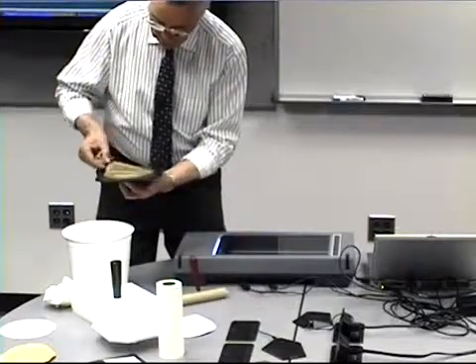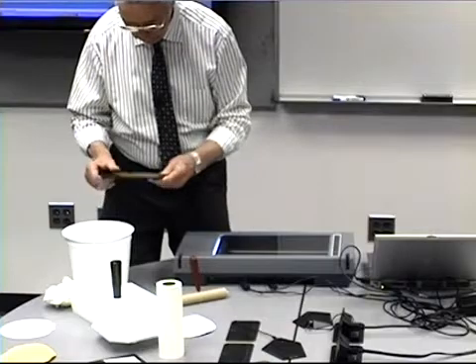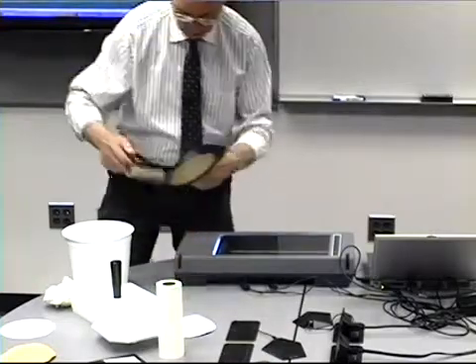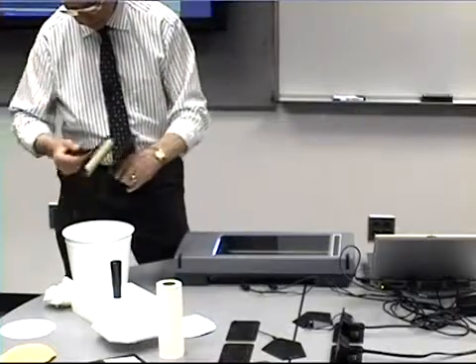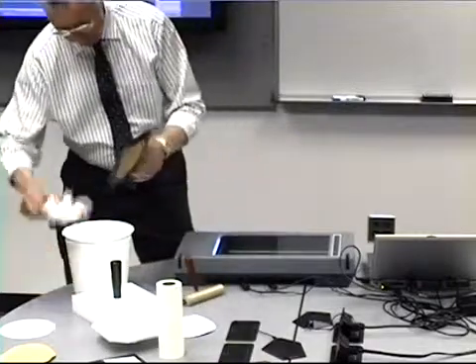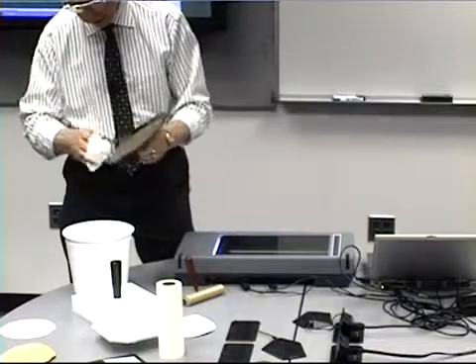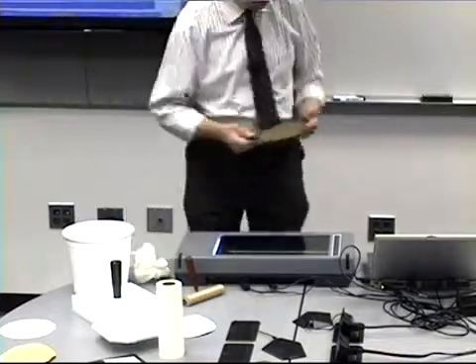and roll it out, you're using a black plate this time instead of white. Is there a reason? Yes, this is a black background, back plate, because in fact our stickies, the hand sheet, now, I don't know whether you can see that there. We'll put it on the stage again.